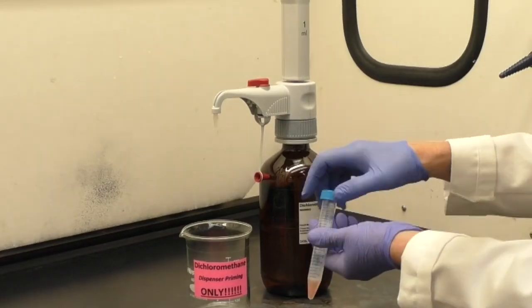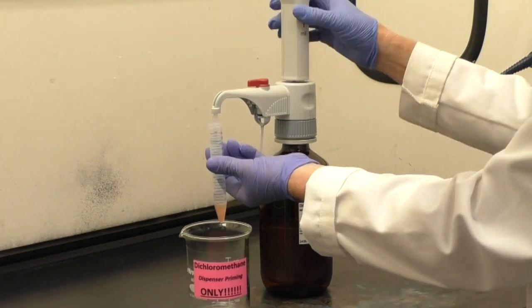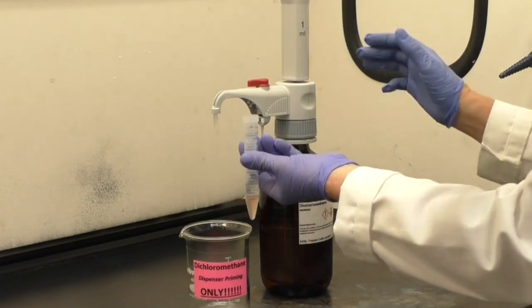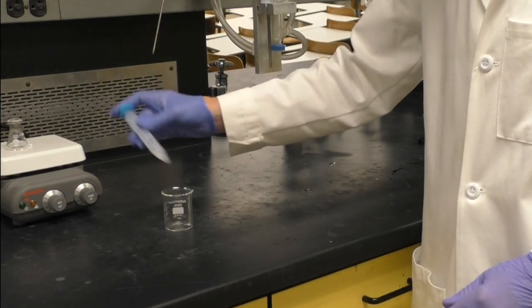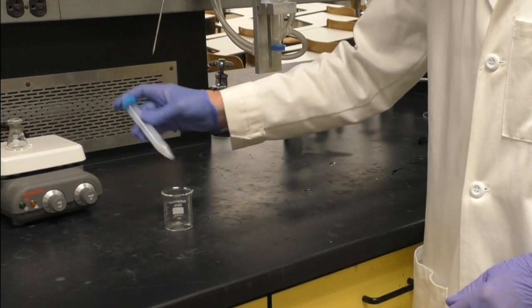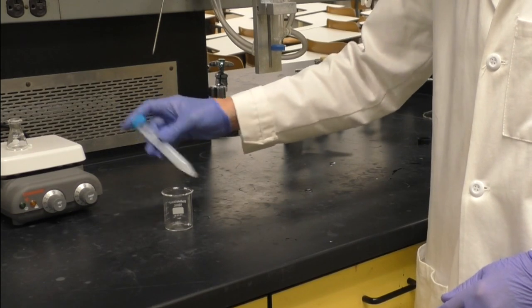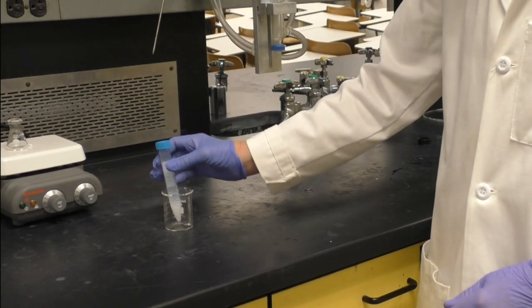Using the 1 milliliter pump, add 1 milliliter of dichloromethane to the centrifuge tube. Cap the tube tightly and shake for about 1 minute. Place the centrifuge tube into a beaker and allow the layers to separate.